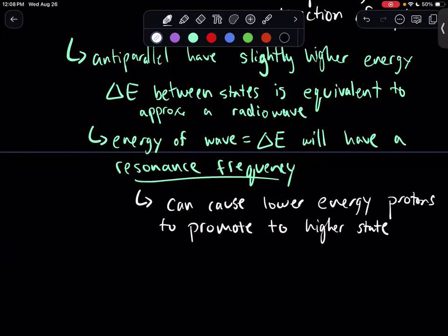So that allows now very specifically those protons to fall back down. So this is the key aspect now.